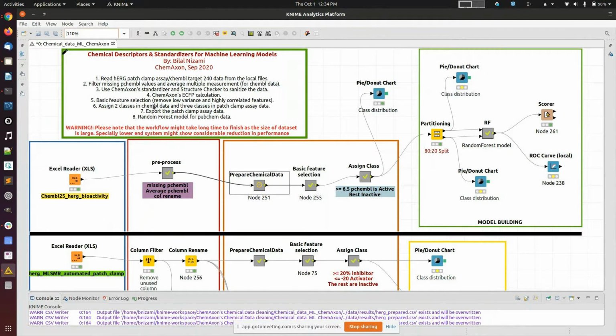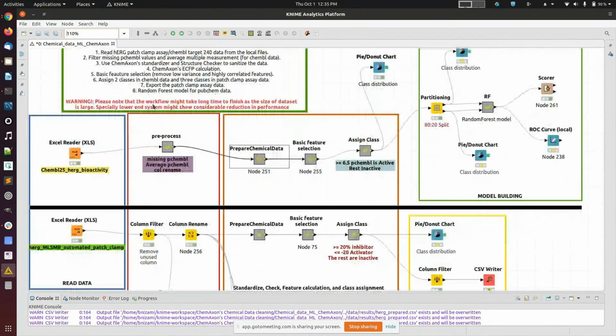So let me give a little bit of brief background about this workflow. There are two workflows basically within the same workflow. I have kept this black line here. Sorry if the people have downloaded it on the first day. I did some modification, and if you have done the export or import of this workflow this morning, you will have the latest one. But the people who have done the export or import earlier, do not worry, nothing has changed considerably. Only these cosmetic changes are there.